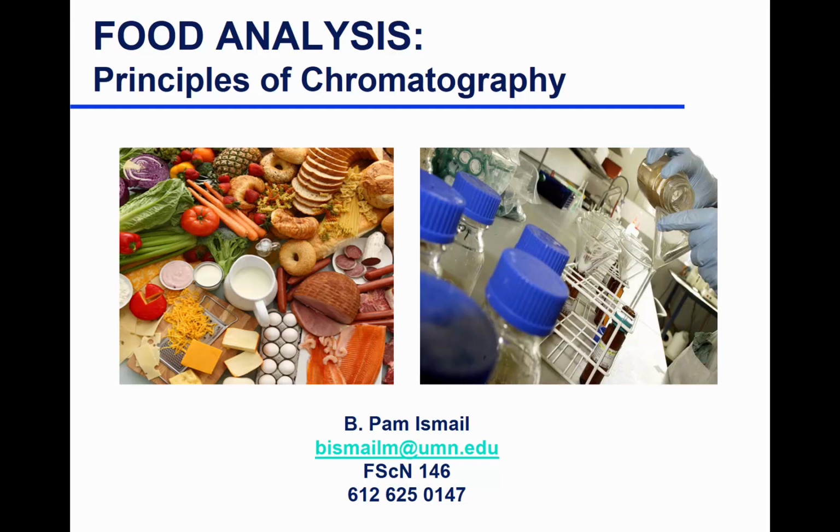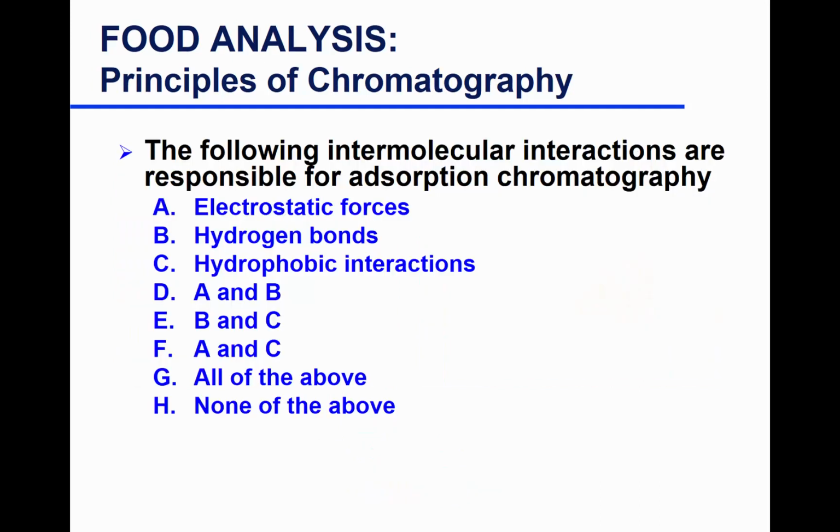because some separation is based on polarity, like Julianne said, but some separation is based on ionic interactions. Other is based on hydrophobic interactions. So you have different forms of interactions, and we're going to talk about that in much detail. Okay, just to know, if you have any idea about what goes on in adsorptive chromatography, which is a form or a mode of separation.